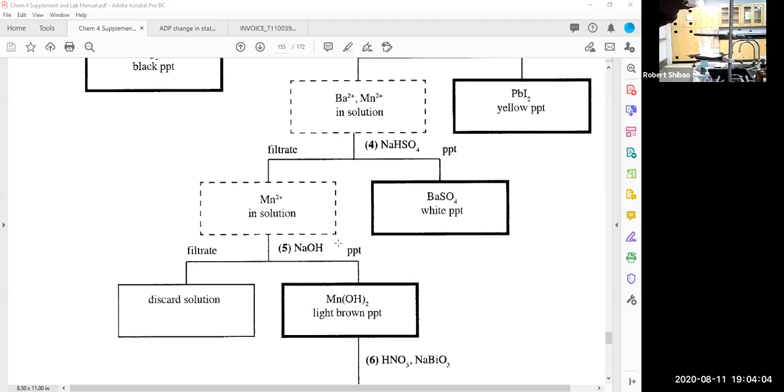So if we look at this, we had a lot of precipitate in there before, but now take a look at how much precipitate there is. So this is lead 2 chloride. You know, at room temperature, it's not very soluble or not as soluble, so it precipitates out. But if I just reheat it, it just redissolves. And so, in fact, if I look at this, it's pretty much negligible. Now, let's go ahead and heat it a little more.